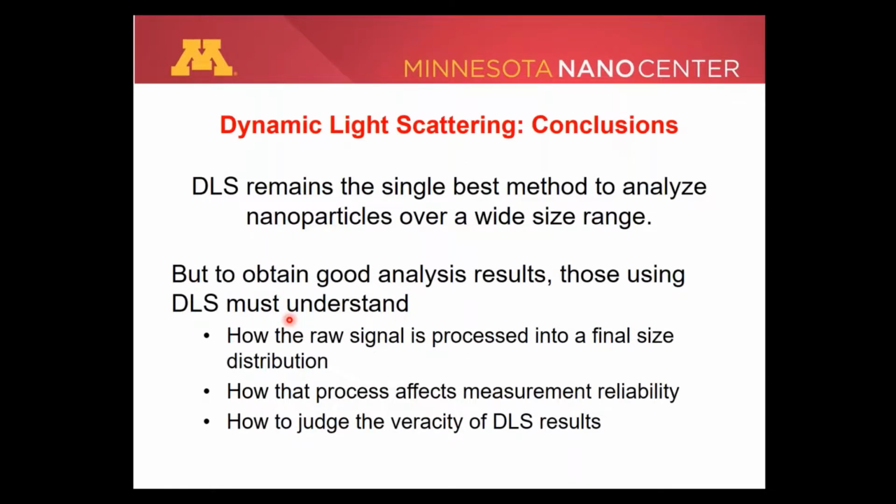So to conclude, I'd like to just leave you with the notion that yes, DLS is still the single best method to analyze a large range of types of nanoparticles over a fairly wide size range. However, to obtain good results, the practitioners of DLS really should have an understanding of how the raw signal is collected, how it's processed into a final size distribution that you then collect, and how that process may affect measurement reliability for a range of different types of samples and sample sizes.